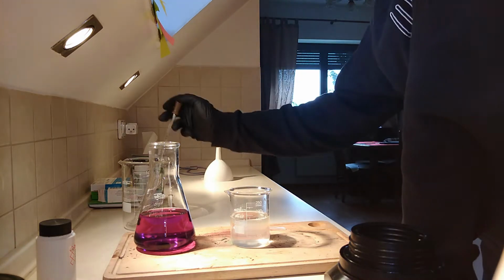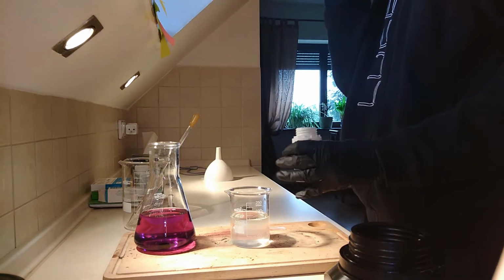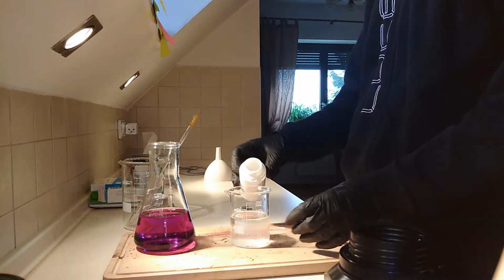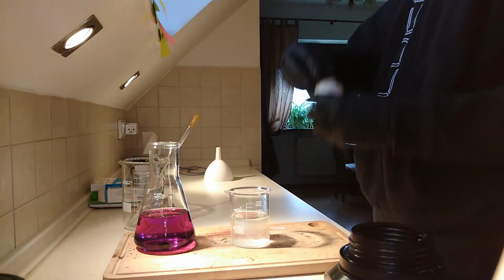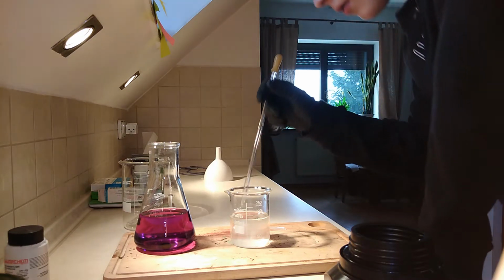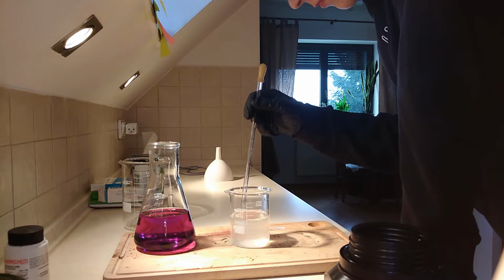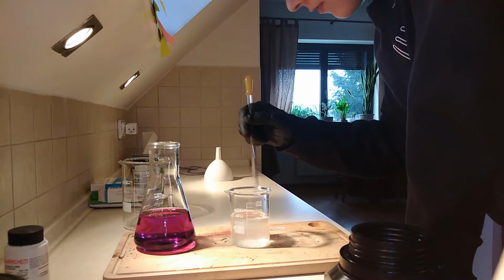So I pipette that out, and now the hydroxide. And here comes the dangerous part, because sodium hydroxide is quite caustic. Not too much. You don't want a lot of hydroxide, you don't want to waste it also. But yeah. Now we have to dissolve the hydroxide.